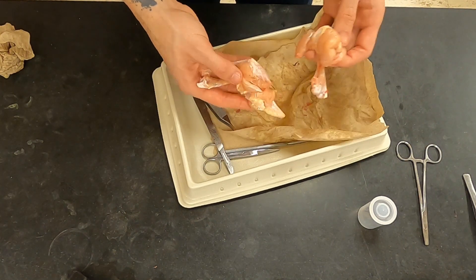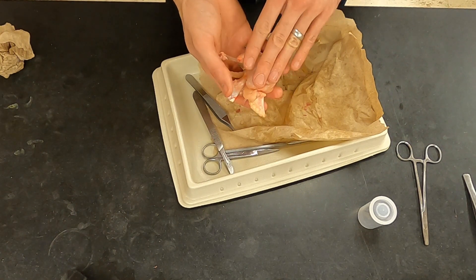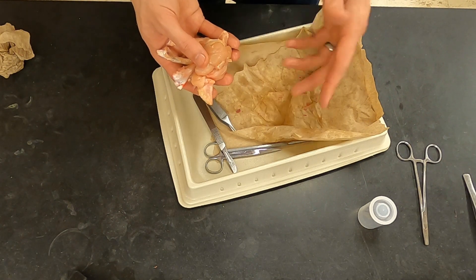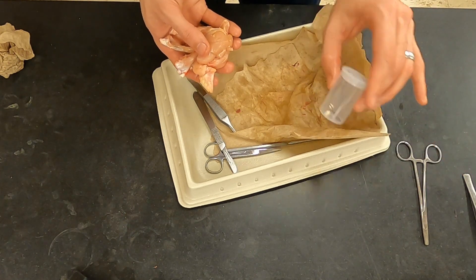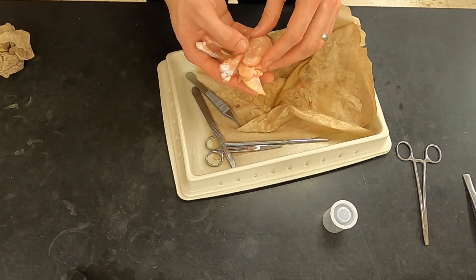Once you're done, for disposal please put all of your pieces of your specimen back into the bag. Remove your scalpel blade and put it into the sharps container. And wash everything with soap and water, because this is raw chicken.